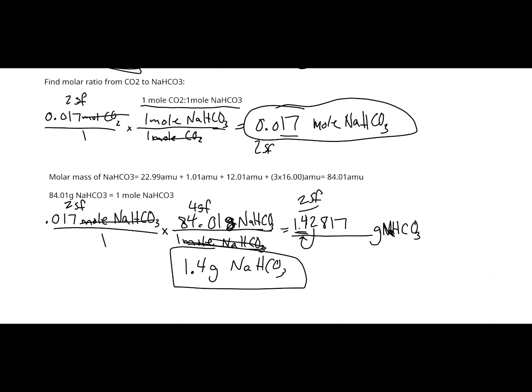That's great, but I need to know what percentage that is of the entire tablet. Did we find out the mass of the entire tablet? The answer is yes, we did. I want you to look right up here for me.